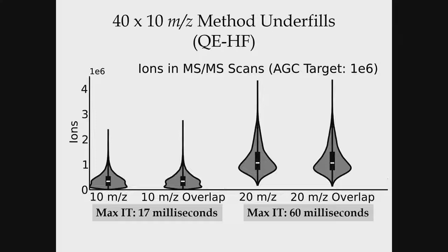Could you say something about what that sample is and the load and stuff? Yeah, so this is a HeLa cell lysate that was run with about 1 microgram loaded.